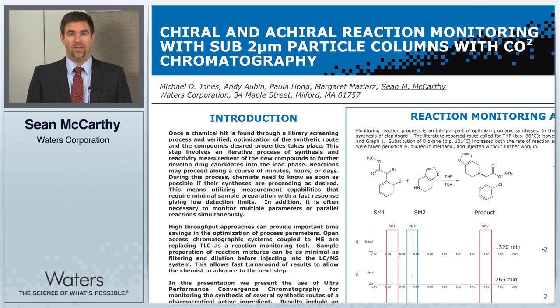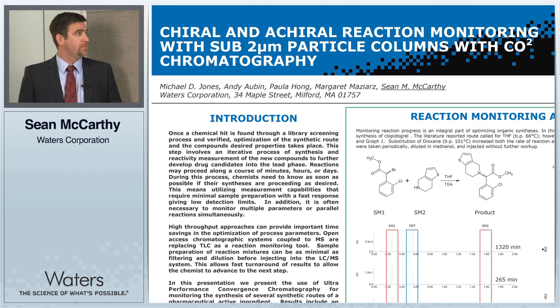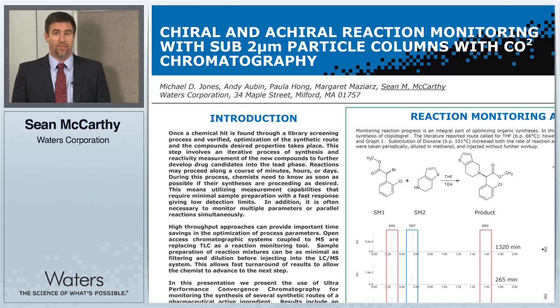Hello, I'm McCarthy. I'm a scientist at Waters Corporation, and I'd like to discuss a poster titled Chiral and Achiral Reaction Monitoring with sub-2 micron particle columns with CO2 chromatography.